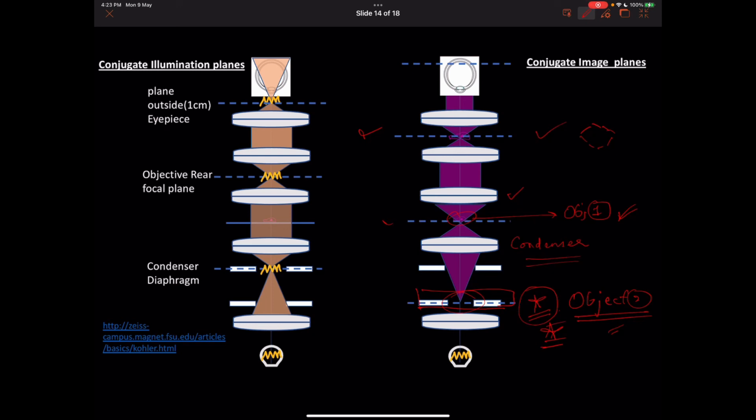alignment. In other words, although the condenser lens can be moved in X, Y, and Z direction, we did not know how much to move in which direction. Therefore, a sharp image of the field diaphragm is used as an indicative reference for our purpose to correctly align the optics of the condenser lens.